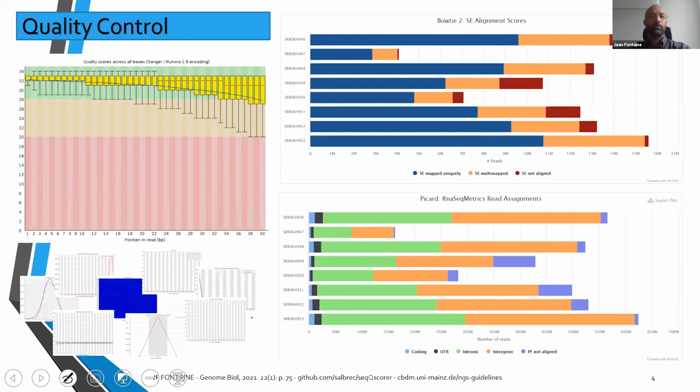We can see plots on the left side here, for example, and this works on the raw data. The raw data are this set of short DNA sequences from the machine. We get, for example, information on each nucleotide, but we could also have more information on the top right of this slide, using another tool, Bowtie2, that will map the short sequences to the reference genome and give you statistics. And here, for example, we compare different samples.